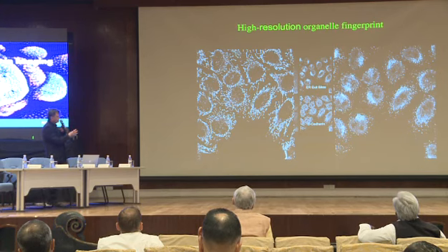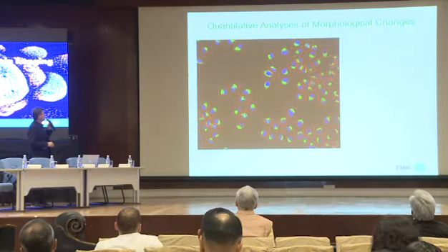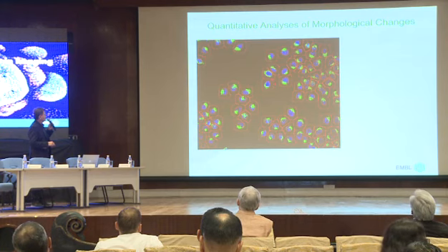If we have such a data set, of course, the challenge is now how to get at the numbers of the changes. Typically, cell biologists have been describing changes with a paragraph of words. But usually what we would like to have is a number, a quantitative description of these changes. One way that we are doing this is, by automated image analysis, recognizing the nuclei and getting an estimation of the cell borders.